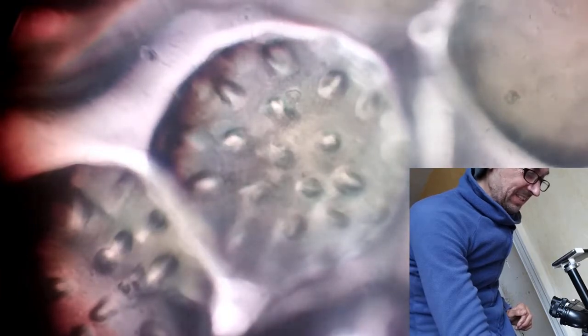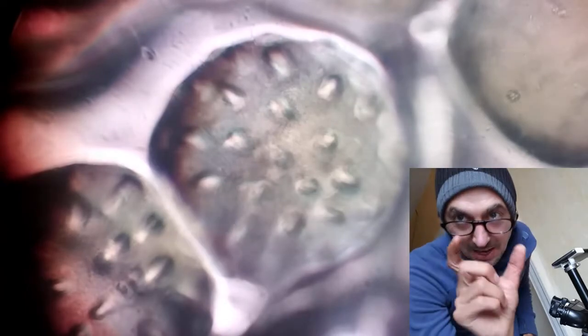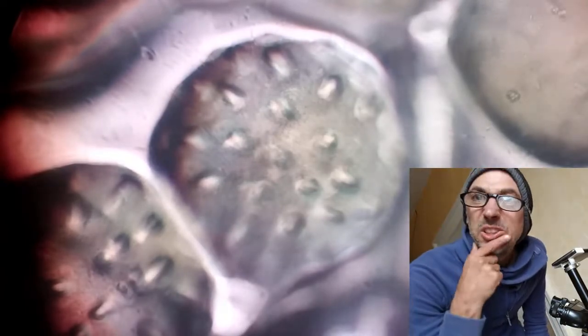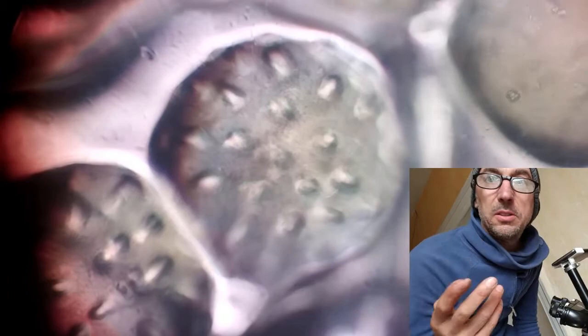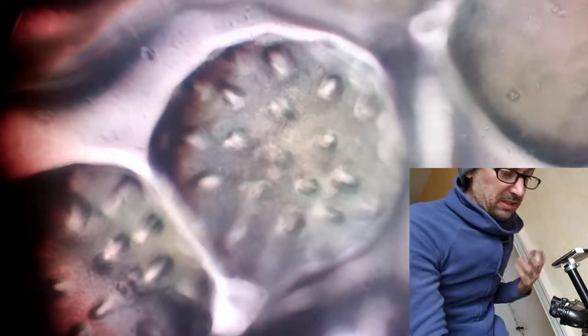If you want to identify this pollen - which flower - well, it's a ball with spikes and you need the size. I would like to use it for mushrooms out in the forest. That's another way to identify them, and with this small tiny scope you could really do that.